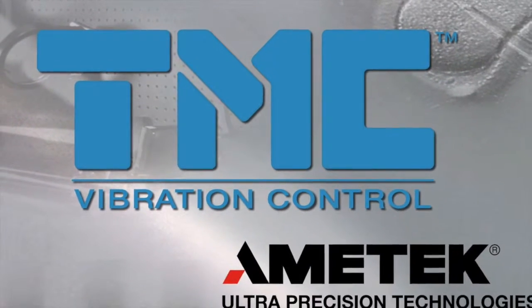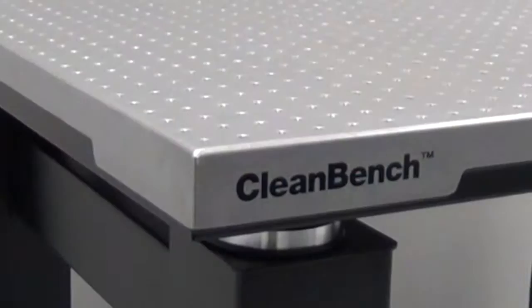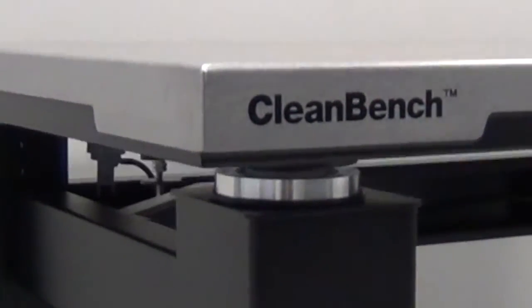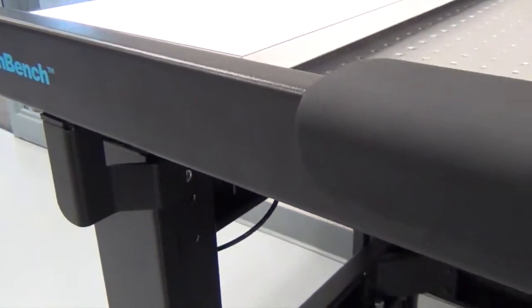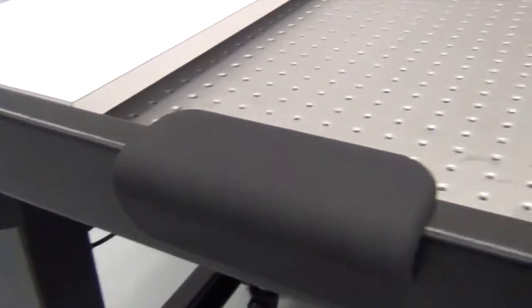In this part of our CleanBench setup series, TMC focuses on typical accessories: front and rear support bars, armrest pads, sliding shelf, and casters.